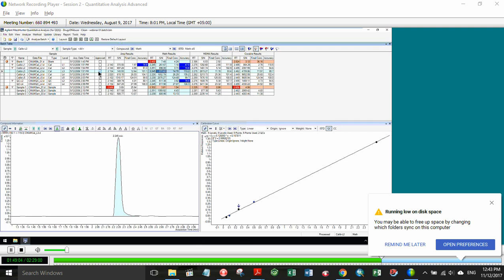On later review, once we get back into this view, this is also an editable column. It's not just for review, so if I decide, well, yes, this is pretty typical for these, and I'm happy with that, I can approve those, or I can undo those and send them back to the technician to ask them to review and correct, however that would work into your workflow. So that's a little overview of compounds at a glance.